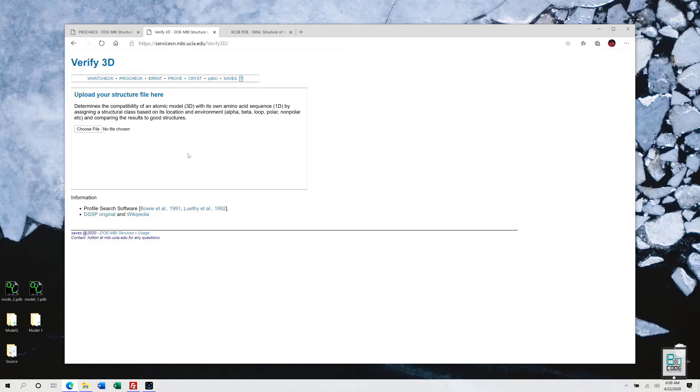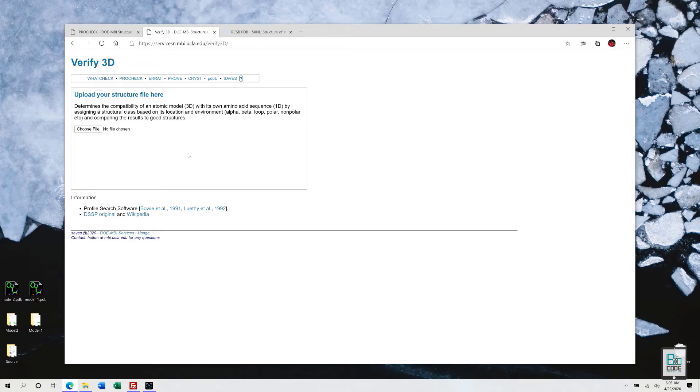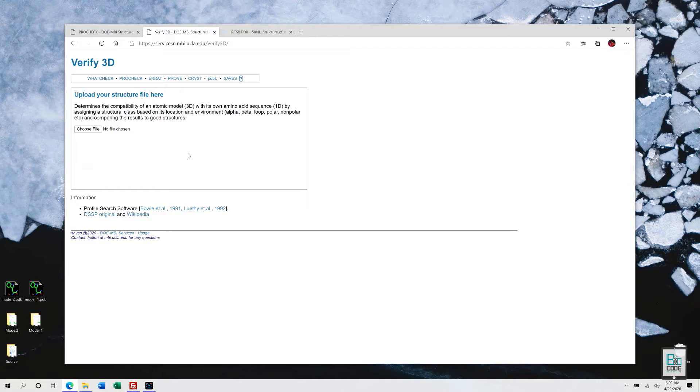In this video, we will see Verify 3D program. It is utilized for model evaluation. What really happens within this tool is a compelling compatibility of 1D sequence or the primary sequence of the amino acids of the protein, which are also known as the amino acid sequence.